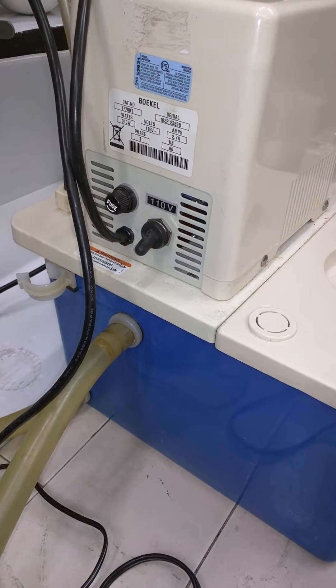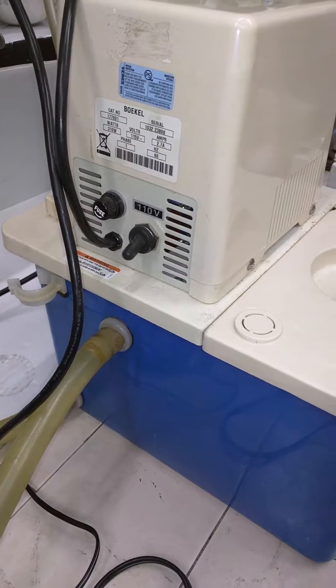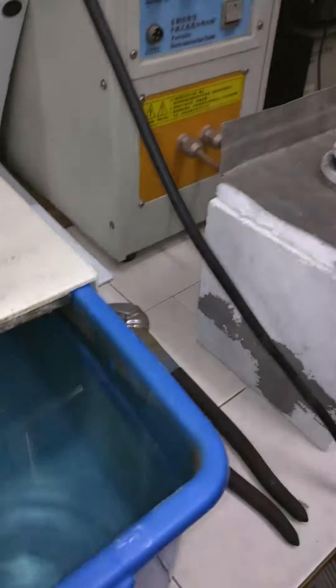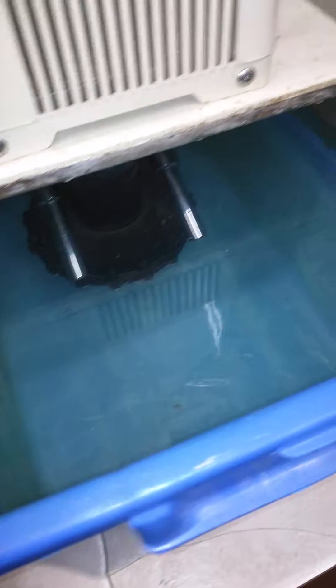This is a small Bokel aspirator pump, which uses water and Venturi effect to create vacuum. So basically it's filled up with water, as you can see down there.